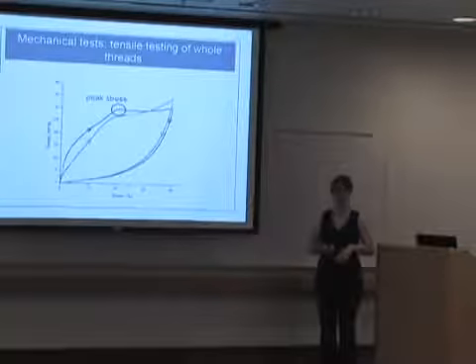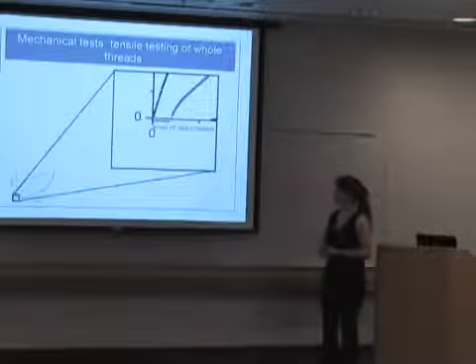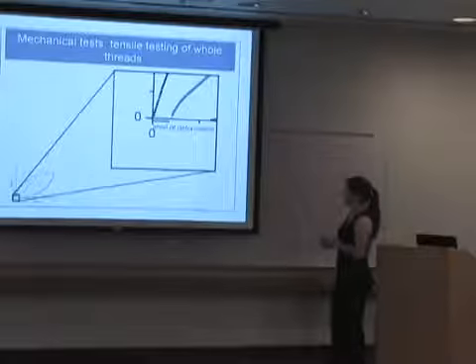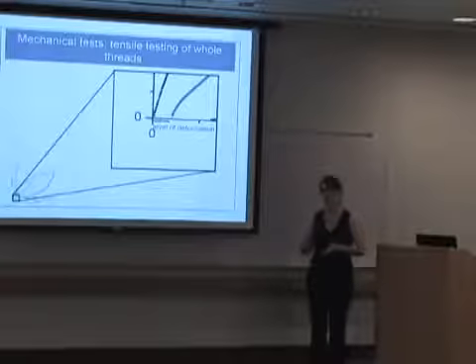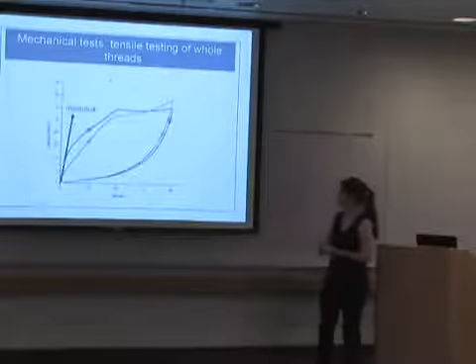which is where the thread has started to deform in response to being put under the strain. Another important piece of information I can get out of it is the level of deformation, which is essentially the gap between the first and second cycle. So that's the percent strain that the sample was unable to recover in the 60 minutes that it was just sitting there in the system.